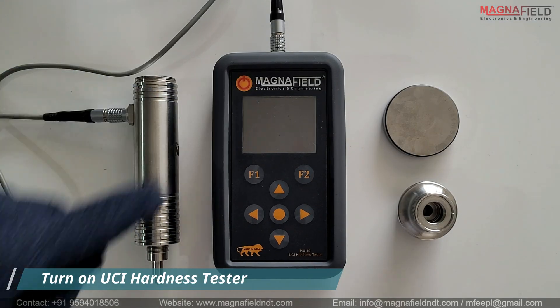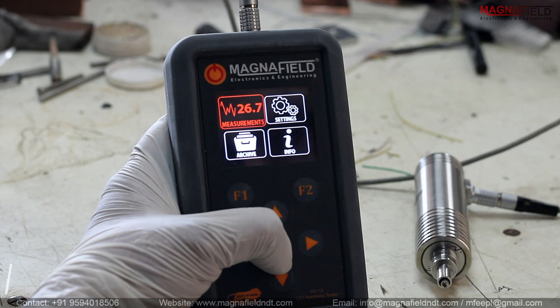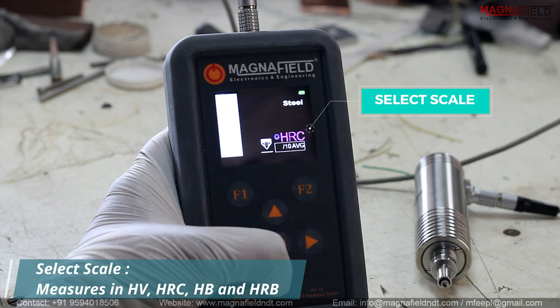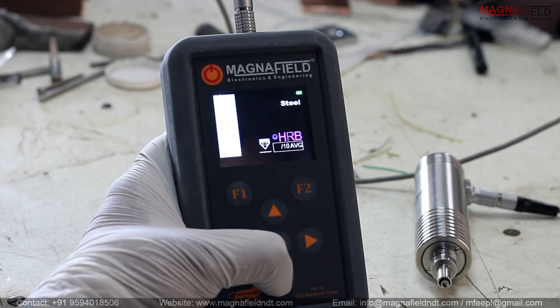Our UCI Hardness Tester measures metal hardness in four different hardness scales: HV (Vickers scale), HRC (Rockwell C scale), HB (Brinell scale), and HRB (Rockwell B scale).